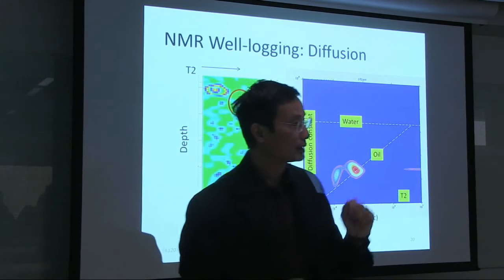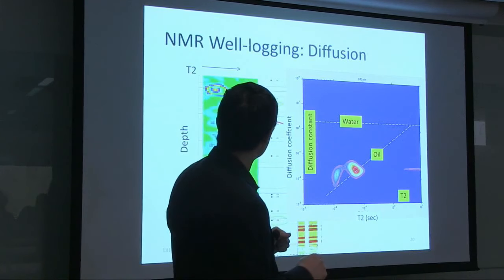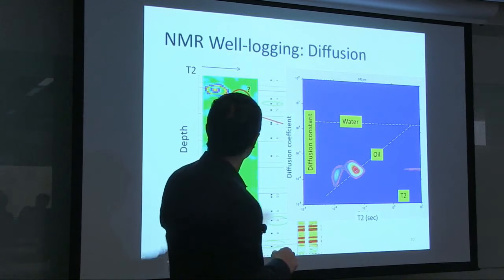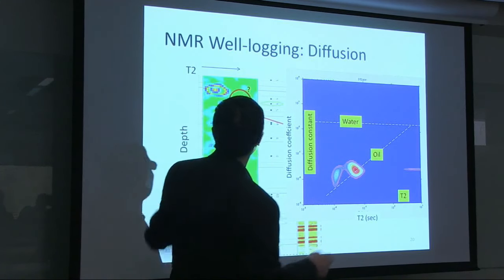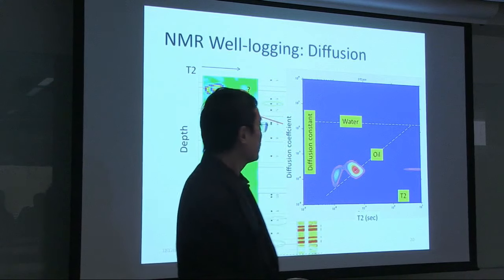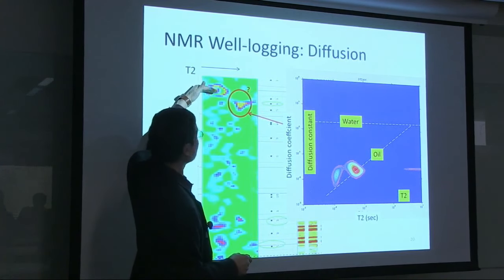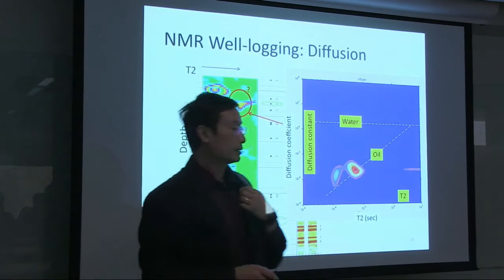Did you raise your hand? Yeah, the bullseye is an artifact. It's something to be interpreted clearly. The bullseye up in the upper left-hand corner. You mean this? No, the one that isn't. Oh, this circled one. Yes, the one that circles itself, as though it is an artifact of the geometry, or an artifact of the way things are being processed. I honestly don't know, but these are many different data sets.